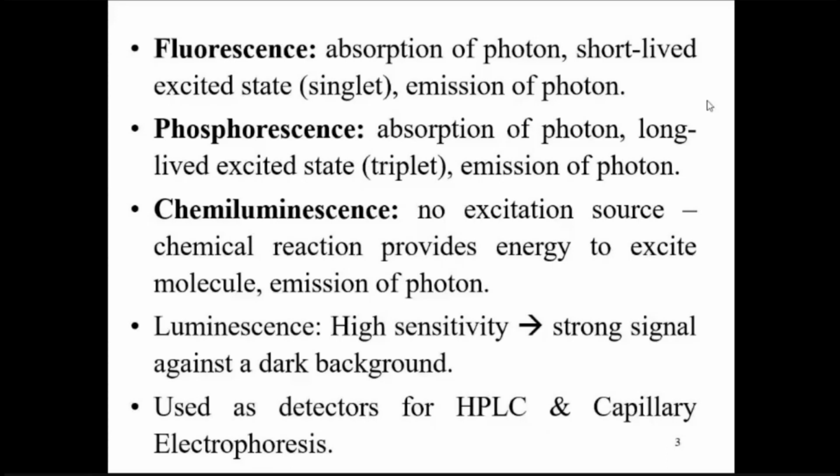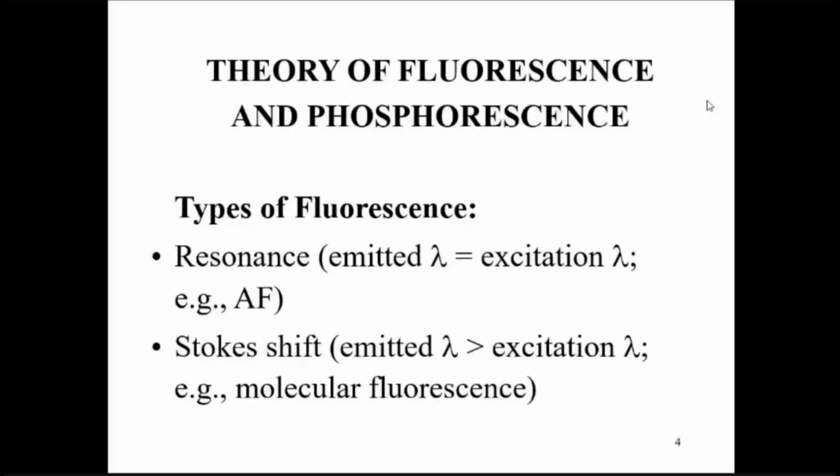That means a small energy gain or loss by the analyte molecule will be associated with a significant change in luminescence. So these two, selectivity and sensitivity, in combination provide a strong signal against a dark background. Now, it is used as a detector for HPLC as well as capillary electrophoresis.